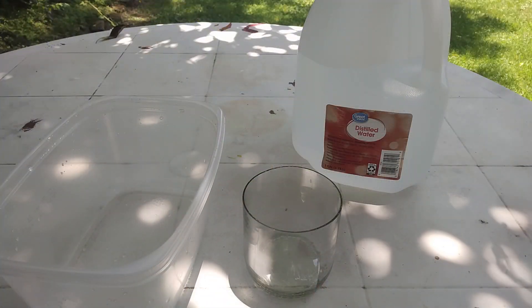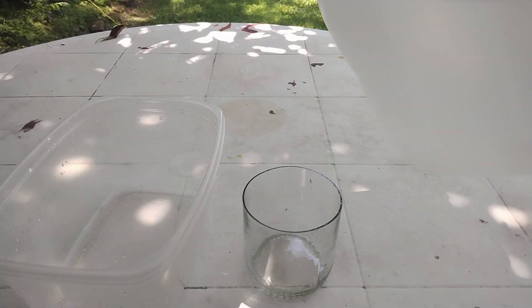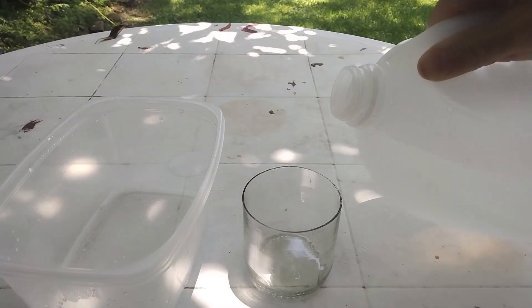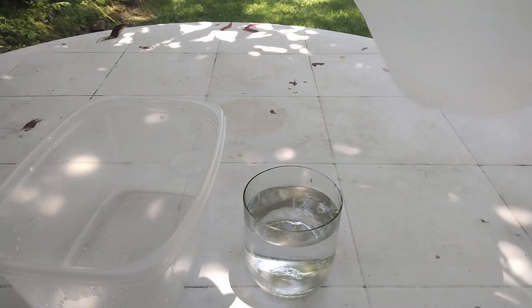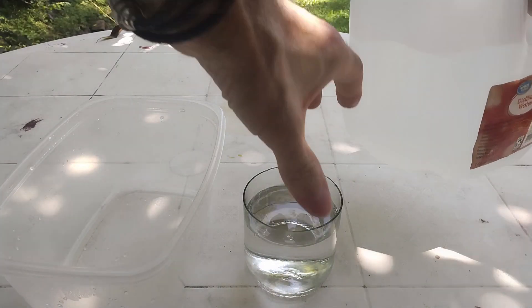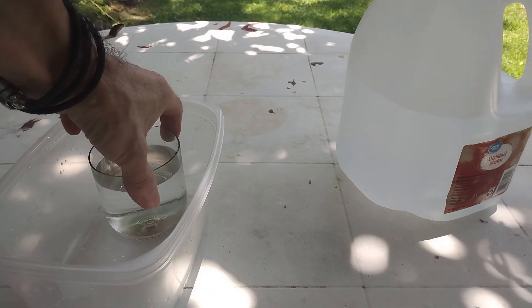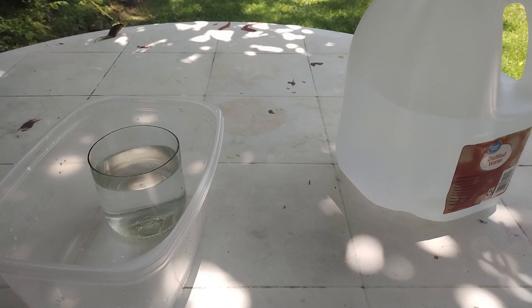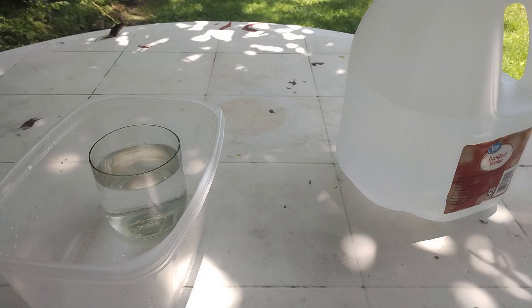All you need is a container with a lid that is large enough to contain another container. The procedure is very simple: we are going to pour some distilled water in the small container, place it in the big container, and then put some impure hydrochloric acid in the big container.